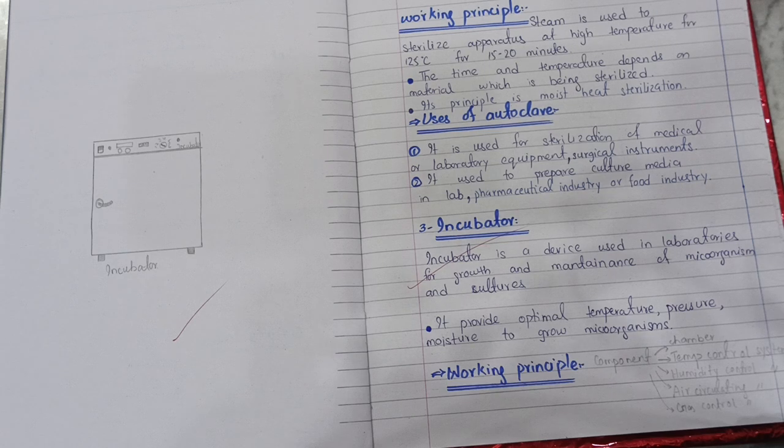So that's why the incubator is a very important medical instrument, especially in the microbiology lab. It provides the optimum temperature, optimum pressure, and optimum moisture, so that every microorganism can grow. The pressure and temperature depend upon the microorganism. If you are using bacteria, it needs different temperature, different pressure, and different moisture conditions.